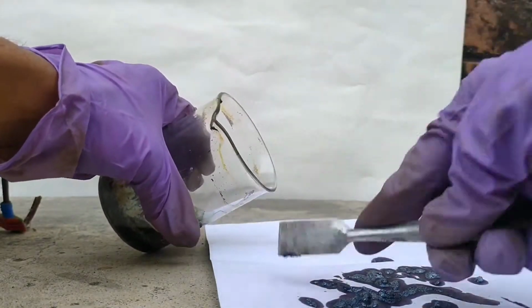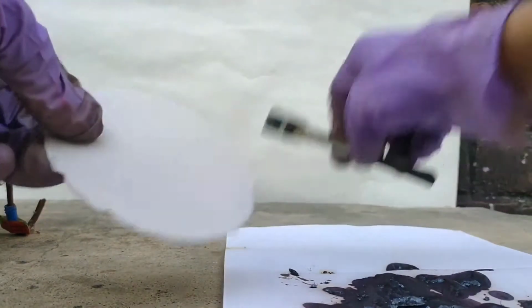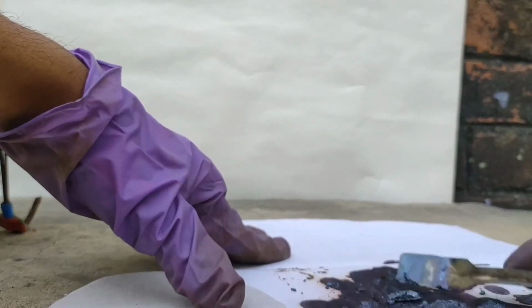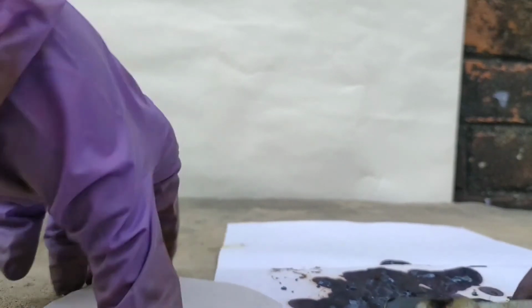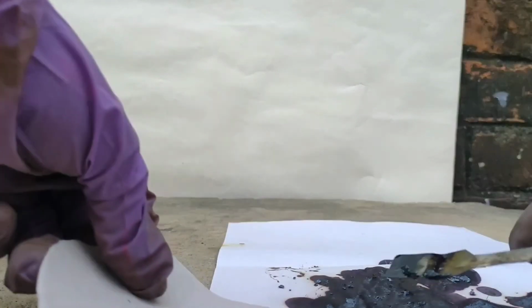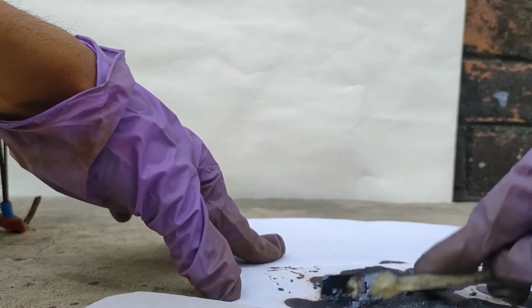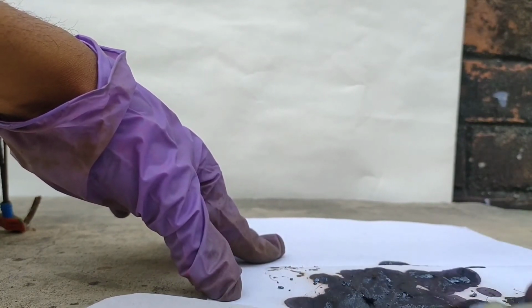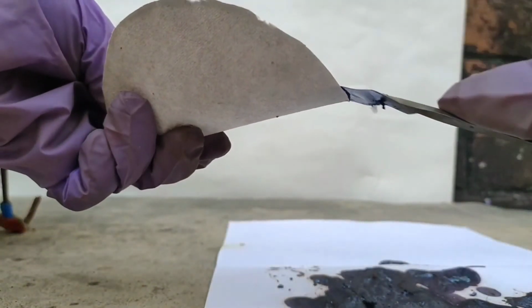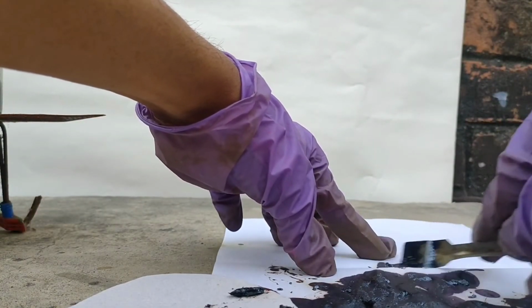So I scraped off the crystals from the beaker and the round bottom flask, and then I transferred these crystals on the filter paper to dry them. The filter paper would soak up the acetic acid. If I would have first used filter paper and not used the A4 paper, I would not have lost some yield because a lot of iodine got stuck inside the A4 paper.